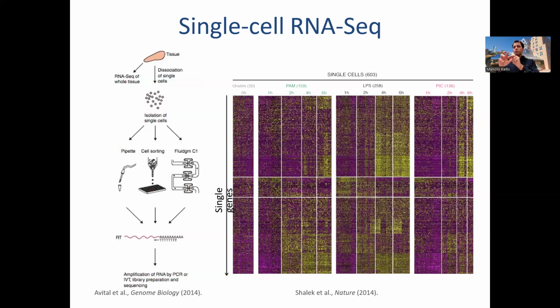In every one of those droplets, you can put a bead that contains millions of barcodes that will then tag every single one of these RNA molecules with the same barcode. And then you can sequence the resulting RNA and look at the barcodes and try to infer which RNAs came from the same capsule, from the same droplet, and therefore which RNAs came most likely from the same cell. Everybody with me here?